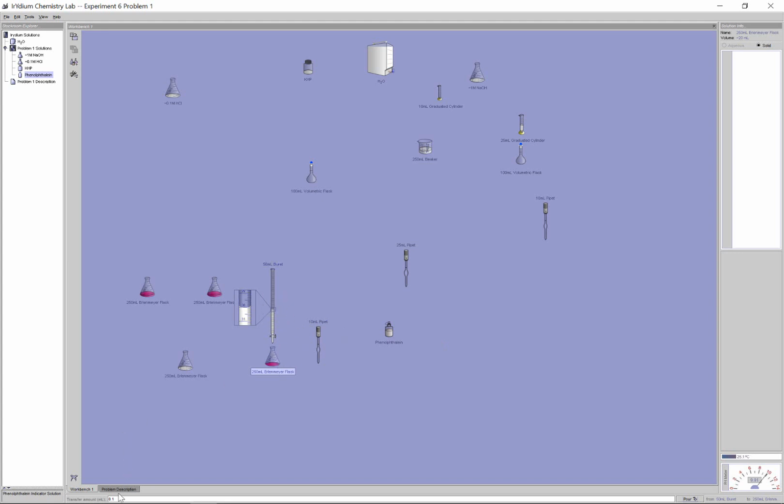I already started dropping it in almost at half drop speed. And basically, I'm just going to take a reading. You didn't need to keep track of whether I'm at 10.1, 10.2, whatever. You just wait till the pink color appears, take a final reading on the burette, and basically that's your volume. So in this case here, it's going to be 30.05 maybe.